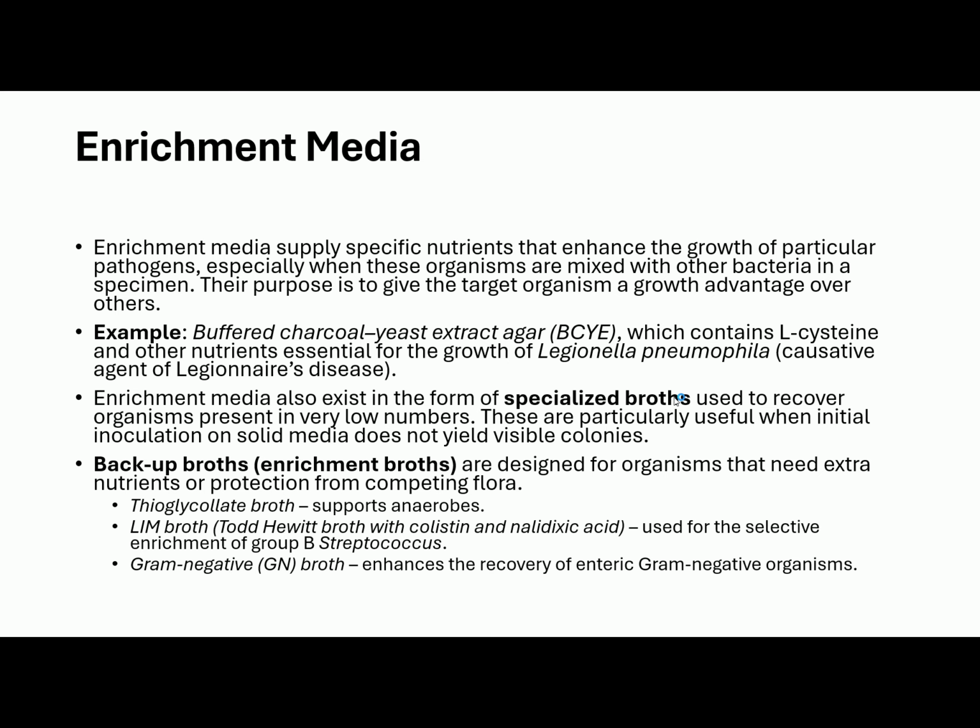Now let's talk about them one by one. Let's start with enrichment media. Enrichment media basically enhances the growth of a single or a particular pathogen. So they would only target a single group. Let's say you only want to grow Staphylococcus aureus. You use an enrichment media targeting S. aureus. It would only support the growth of S. aureus. Basically, it provides a growth advantage over others.